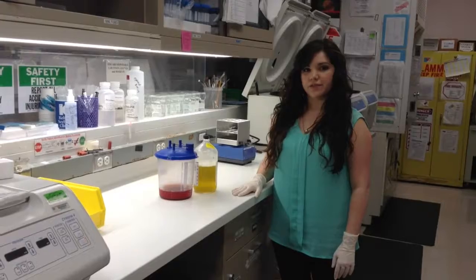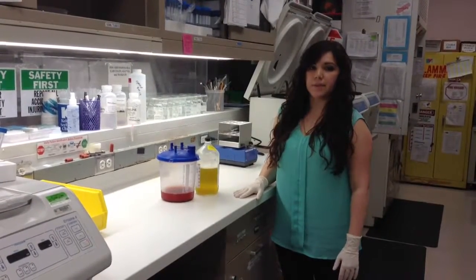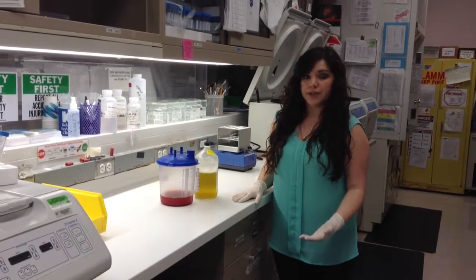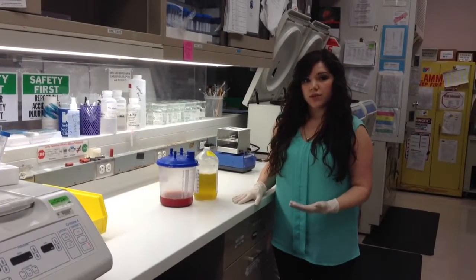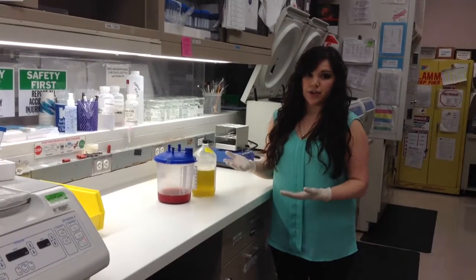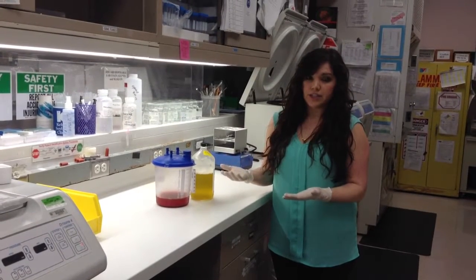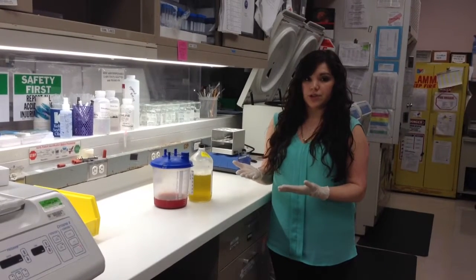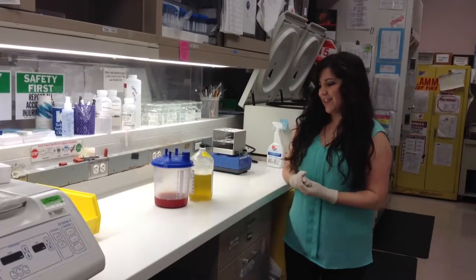During day one of the student's summer rotation, you will be responsible for teaching them how to process body cavity fluids. The things that we want to focus on most is explaining to the student why certain things are happening at every step and every stage. For example, you'll want to fully explain the purpose of centrifugation and why we can discard the supernatant, separating cells of interest from cells that are uninteresting to us diagnostically, such as red blood cells, and the purpose behind the gradient separation technique of Ficoll-Hypaque that we routinely perform here in our cytology lab.